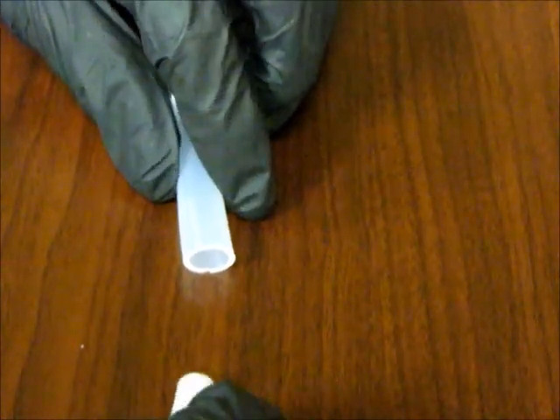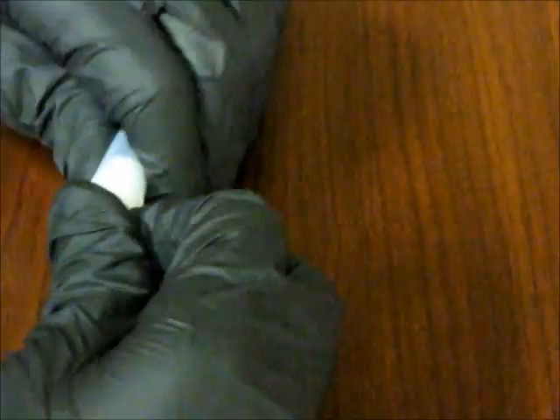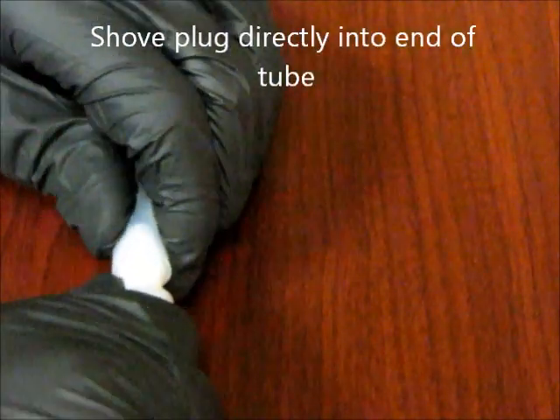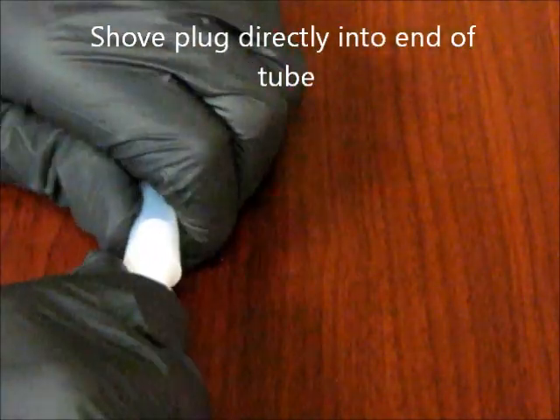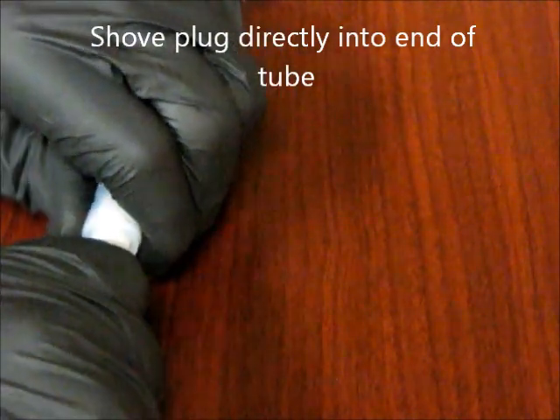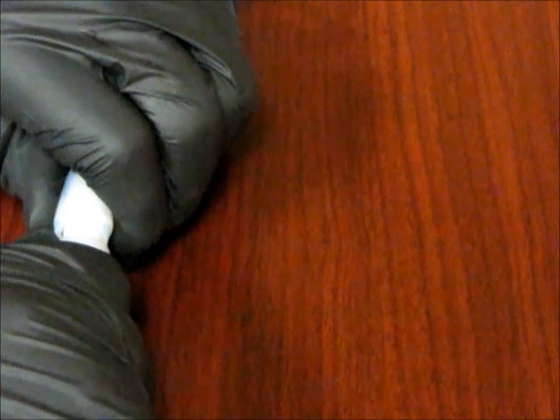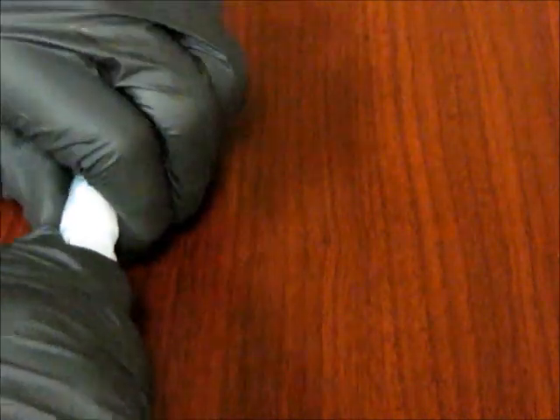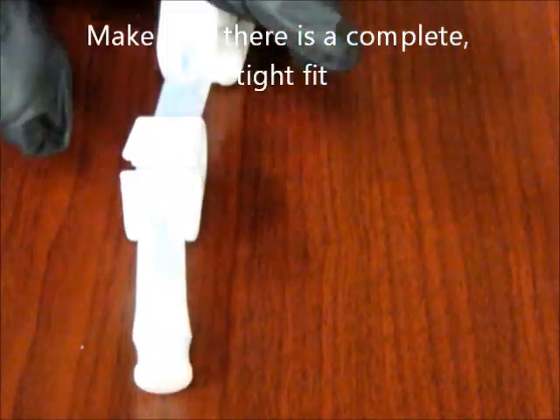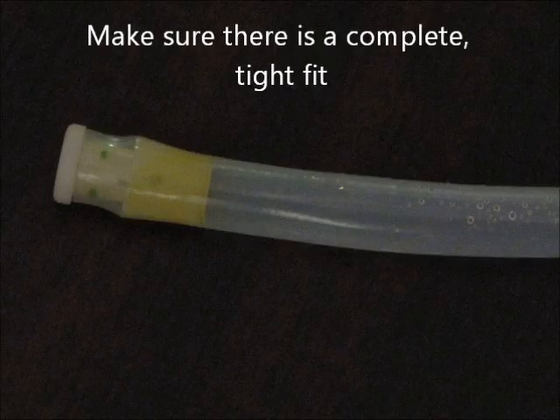To insert the first cap into the tube, shove it directly into the first hole of the tube. Make sure you have a complete tight fit so that the cap is completely inserted as shown.